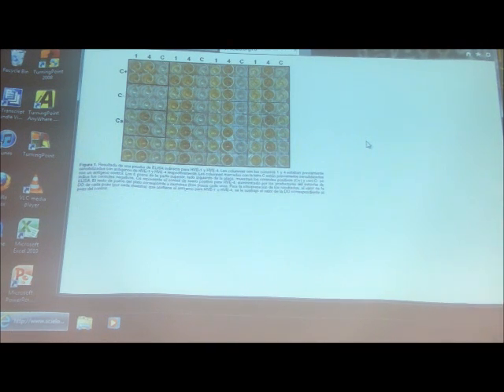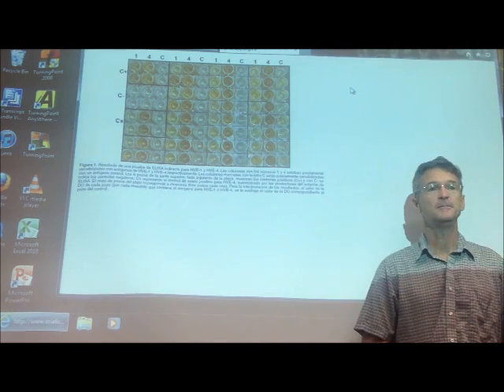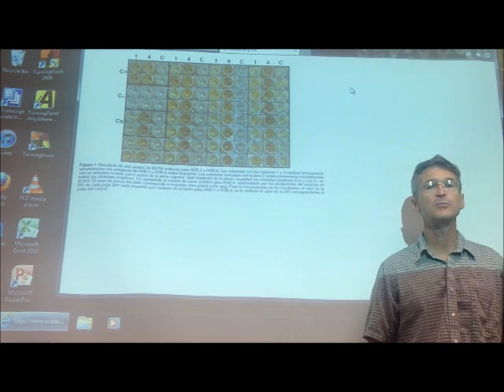And so just looking here on, again, Google Images, we have a typical ELISA plate, and you can see what it is. It's a microtiter plate, and we're going to have different colors in each well, and the darker the color, the greater the presence of a particular antigen. So that's your end result.